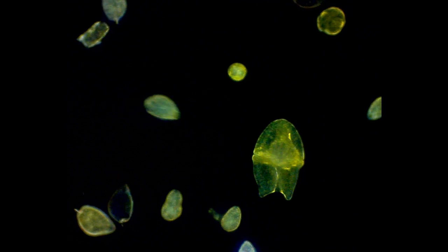Switching to darkfield, you can see again the proracentrum on the right, and appearing on the right now is the akashiwo.